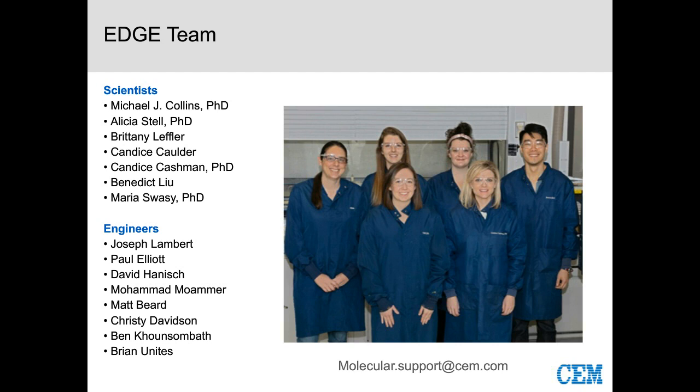This is a multi-part question, so bear with me. Did you do a concurrent analysis of the packaging of the snack cake? The implication is that the PFAS migrates from packaging. And how might the extraction change?